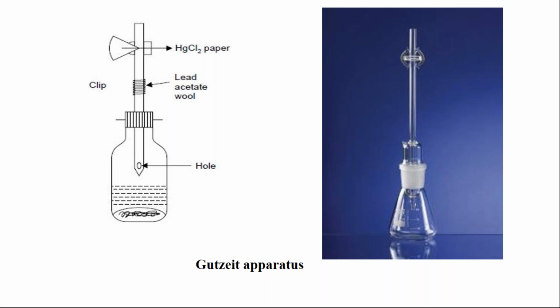So next, coming to the glass tube, the upper end of the glass tube has been fitted with 2 rubber bungs. Here in this right side image, they have just shown 2 glass tubes held together by a clip. But in reality, this apparatus is not most commonly used. The one which I used in the previous college was made out of rubber bungs itself. The rubber bungs' diameter is 25 mm, but the hole that is created is exactly 6.5 mm.